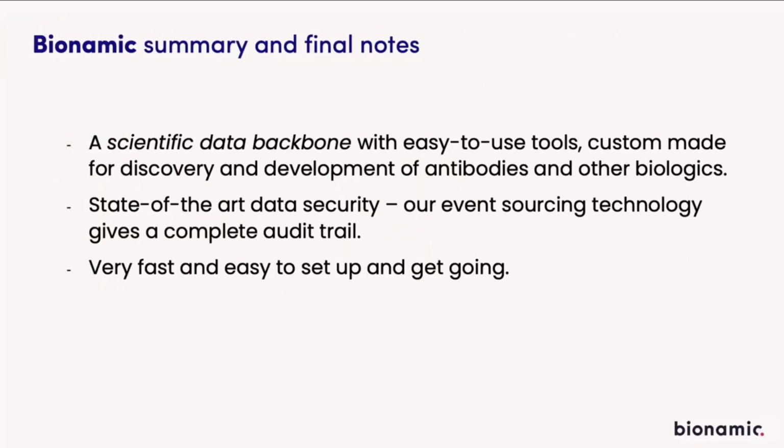So again, the scientific data backbone, as we call it now, together with these fairly easy to use tools that you saw examples of today, are custom made to fit the context of antibody discovery and development, but also other types of molecules. And you can define your own library designs and get automatic checks that they conform to the design and so on.